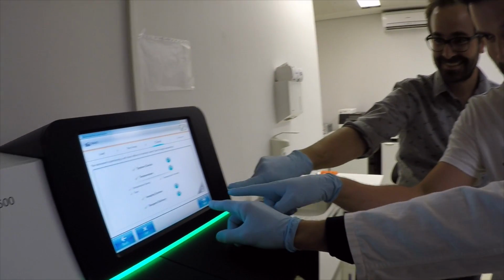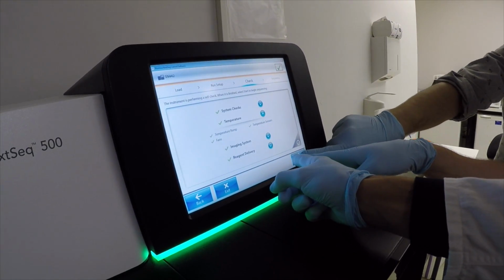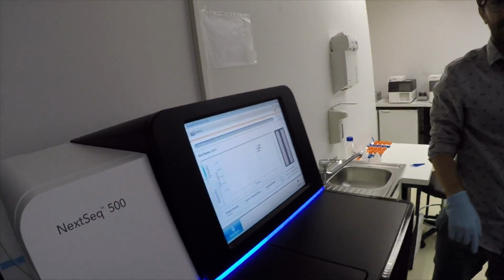Hi again, welcome back to the LilBUBome video log, where today we'll show you a first glimpse of what Bob's DNA sequence looked like when it initially came off the sequencing machine. Last time we left off having prepared Bob's DNA and loaded it onto the sequencer. And once we started the machine, we first had to wait a couple of days for this to happen.